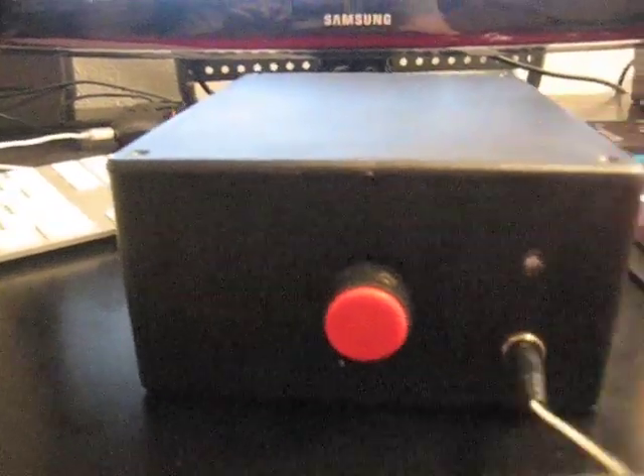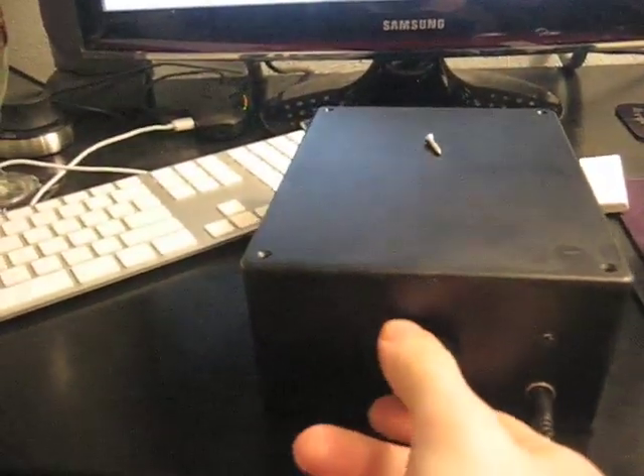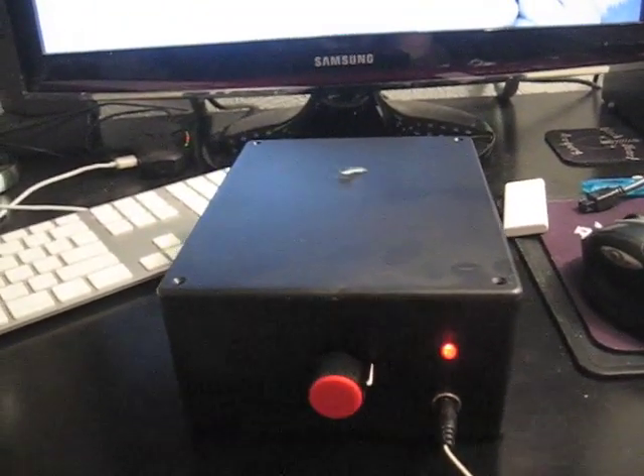Let me give you a little demonstration first and then we'll look at what's inside. I'm just going to put this small screw on top and we'll turn it on. You can see the LED glows in intensity for more power.